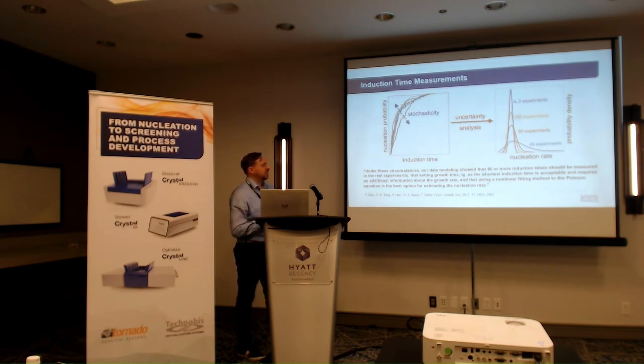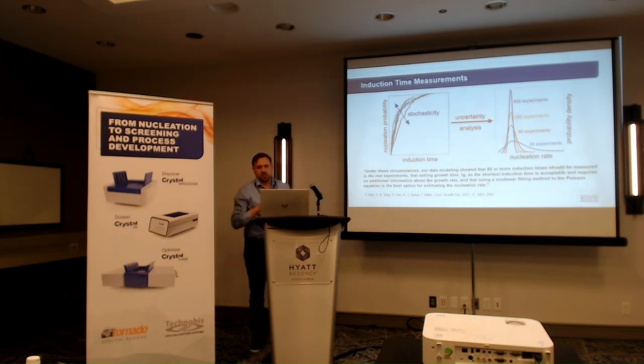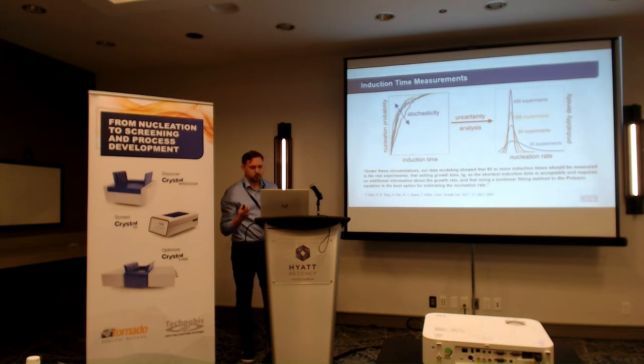So do you really want to be sitting there taking 400 measurements when you just do not have the time to be taking that? Well, the conclusion he reached was that, under these circumstances, 80 or more induction times should be measured for real experiments. You can also set the growth time, between when you first get your nucleation point. It's not very clear on here, but this is a tiny point. Basically, between zero and when your first new crystal is detected, you can define that as TG, assuming that something is crystallized or nucleated as soon as supersaturation has been reached.